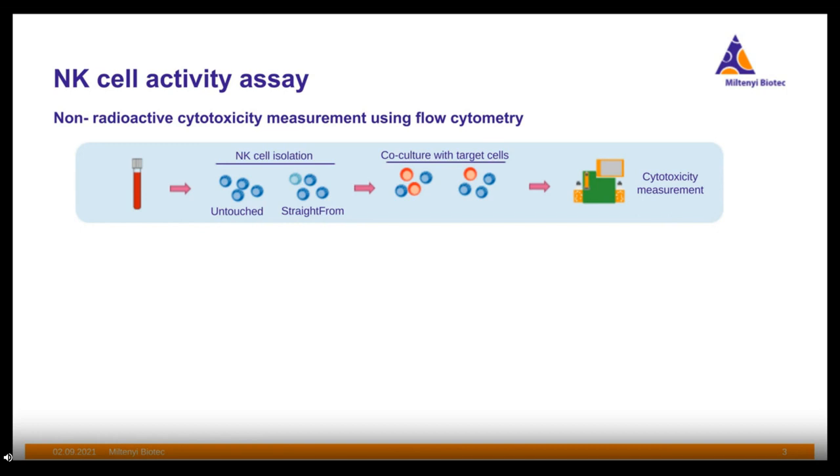Of course, the other method was isolating the NK cells using a straight-from-blood method, and the next assay followed the same principle.